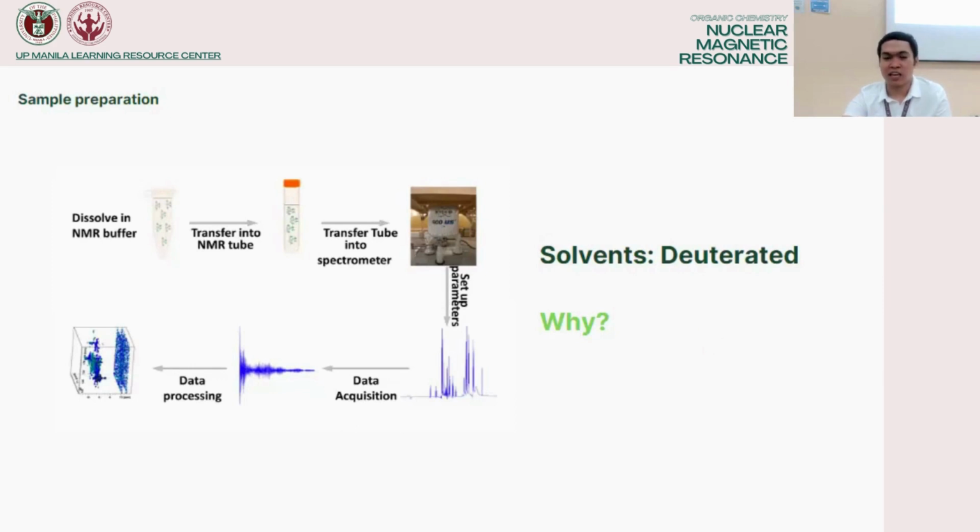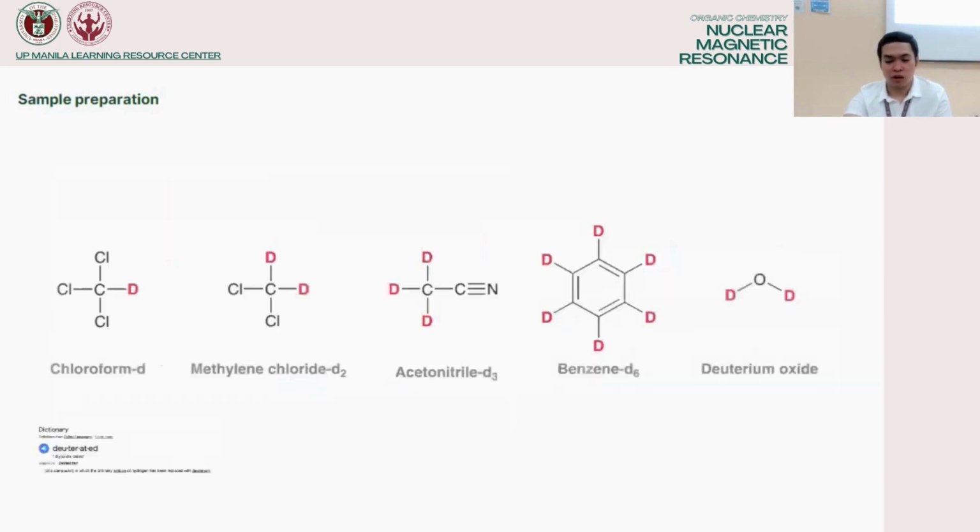If you analyze, we are looking at the spectrum of hydrogen and carbon, because that is NMR. So we want no CH bonds, correct. So you can see, those are the deuterated solvents. So no hydrogen. Not much hydrogen to what?